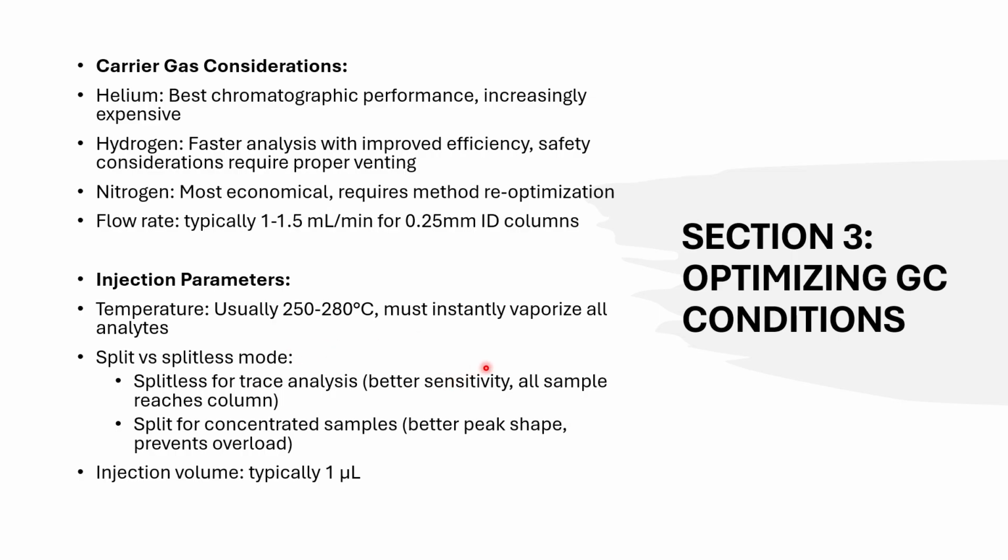It must instantly vaporize all your analytes. Let's talk about split versus splitless mode. So if your sample is concentrated, then you need to go with split mode. Therefore, it would give you better peak shape and it would prevent any overloading in your column.